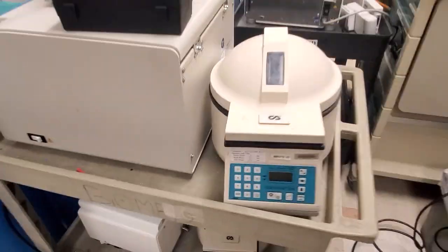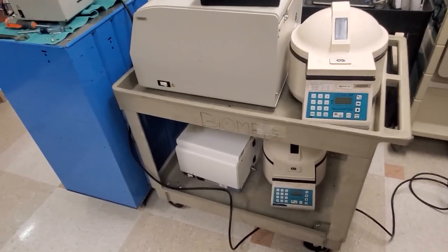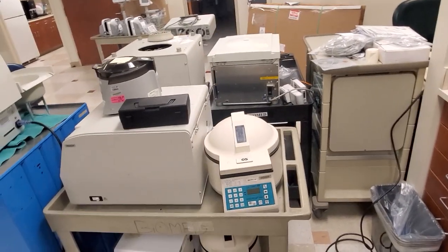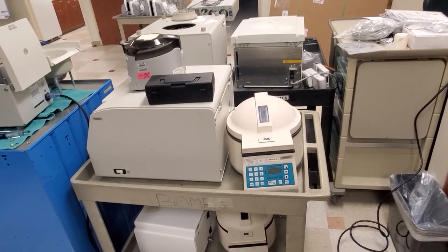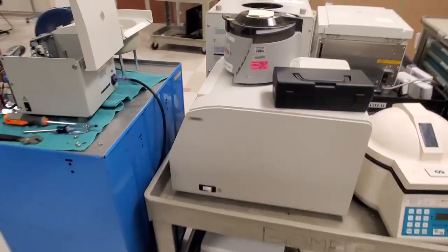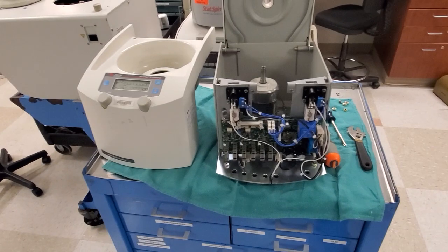All these guys have been fixed in the last couple days. Then we have to do performance verification, which is what that guy is going through right now. They're going to have to run for at least an hour to make sure there are no more codes that pop up on these motors, make sure that they're good to go, and then we do a final speed test before we release them to the customer.